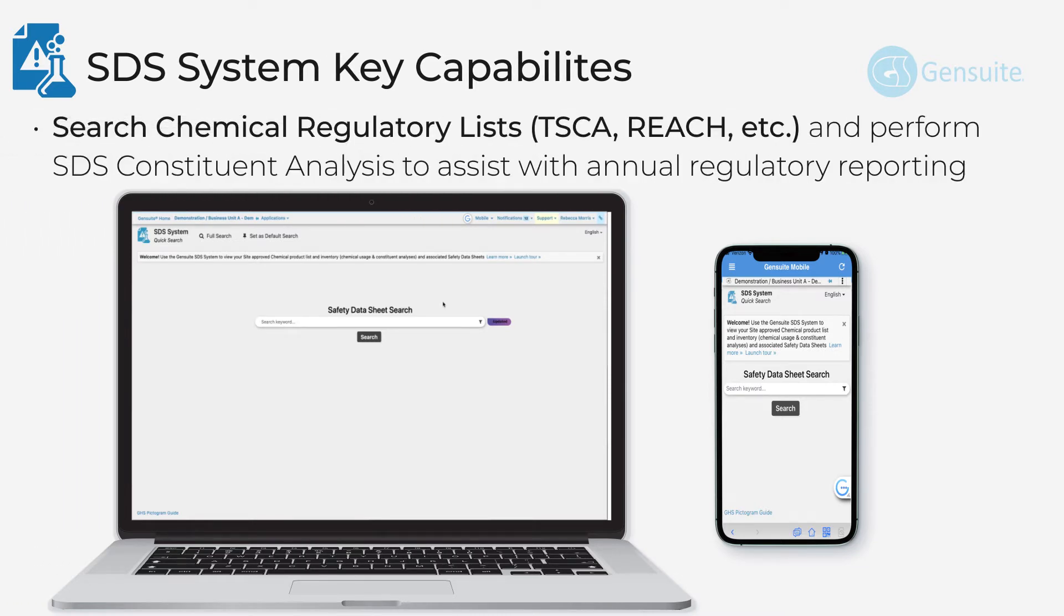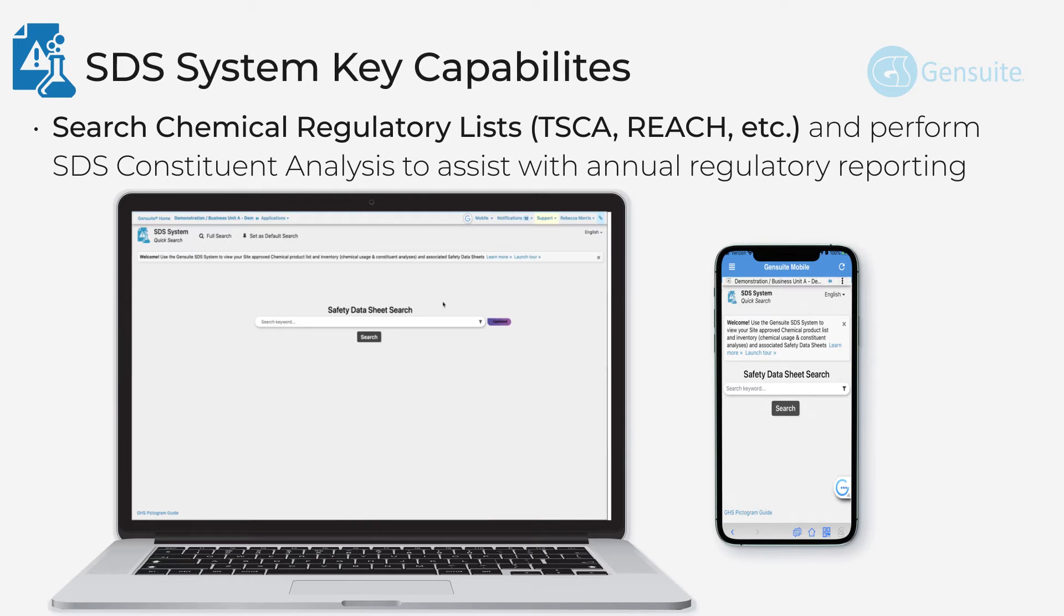Search chemical regulatory lists, TSCA, REACH, etc. And perform SDS constituent analysis to assist with annual regulatory reporting.